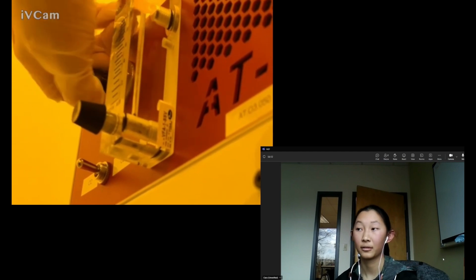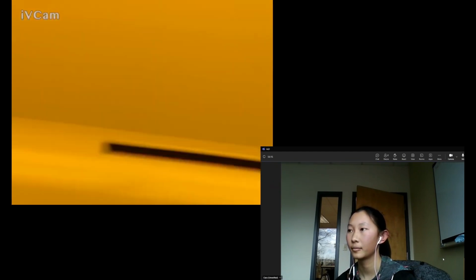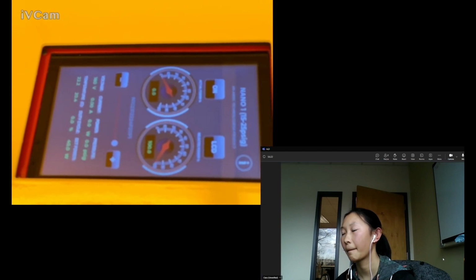There's still no reading on the screen. Interesting. I made it all the way to the right, and there's still no reading.